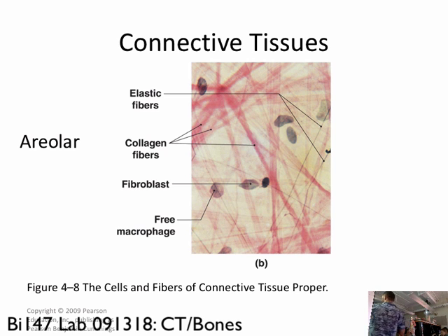So there are fibroblasts. Fibrocytes is another one that's related. The macrophage is a type of white blood cell. I showed you that in my high school class. Anyways, macrophage is like a white blood cell. Macro means large. Phage means to eat something. So it's these big white blood cells that are pretty crazy looking that go around and eat pathogens. All of these cell types are found somewhere in this tissue. What do I have listed as ones on there to identify?